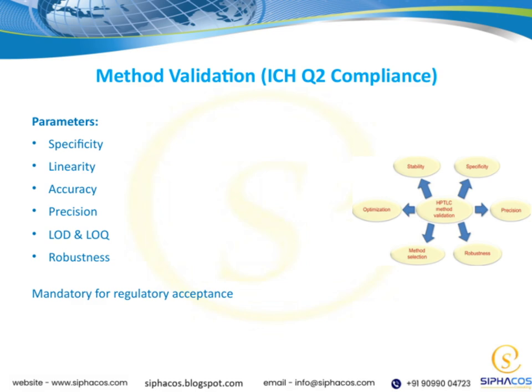All of these parameters are mandatory for regulatory acceptance because they collectively demonstrate that our method is valid, reliable, and fit for purpose. So, when we're validating our analytical methods, keeping these key points in mind helps us meet regulatory standards and ensures the quality of our data.